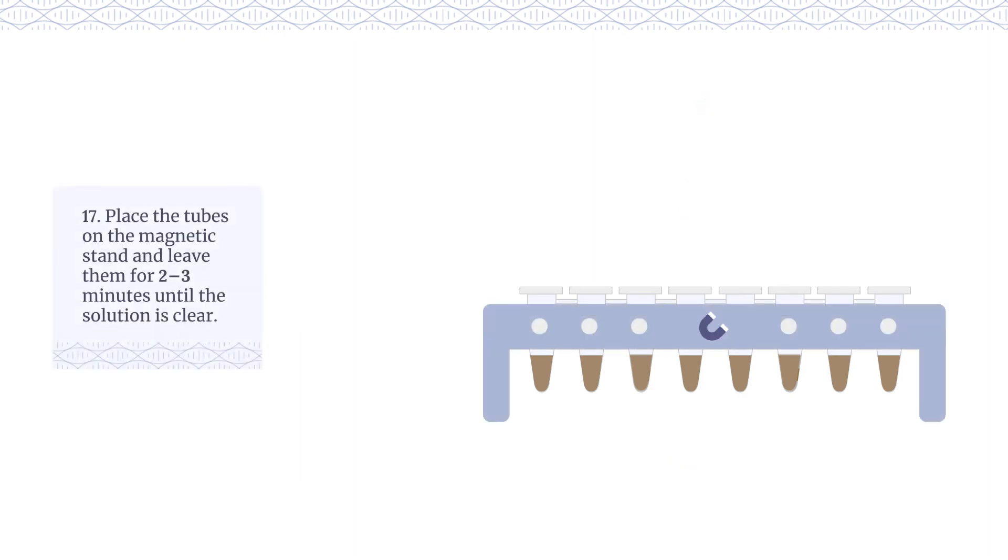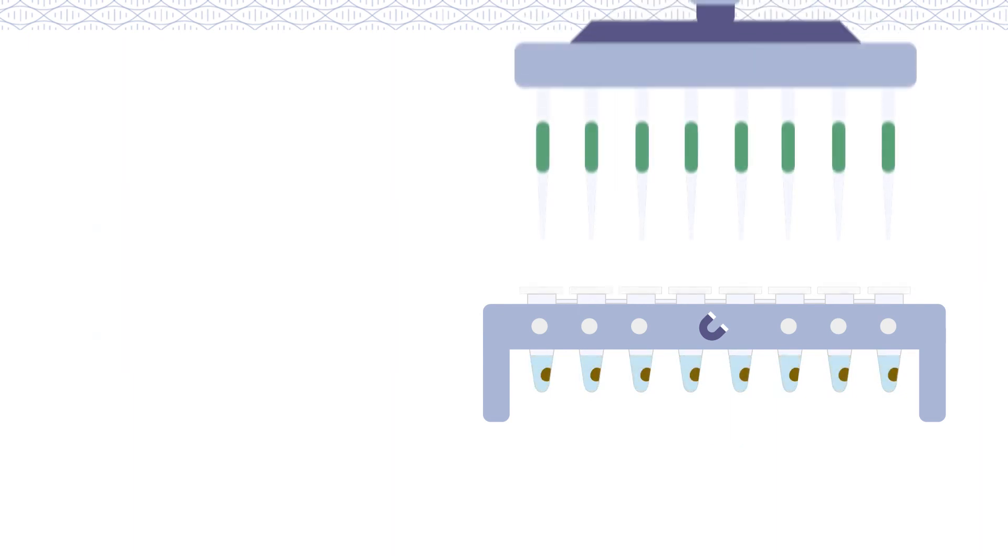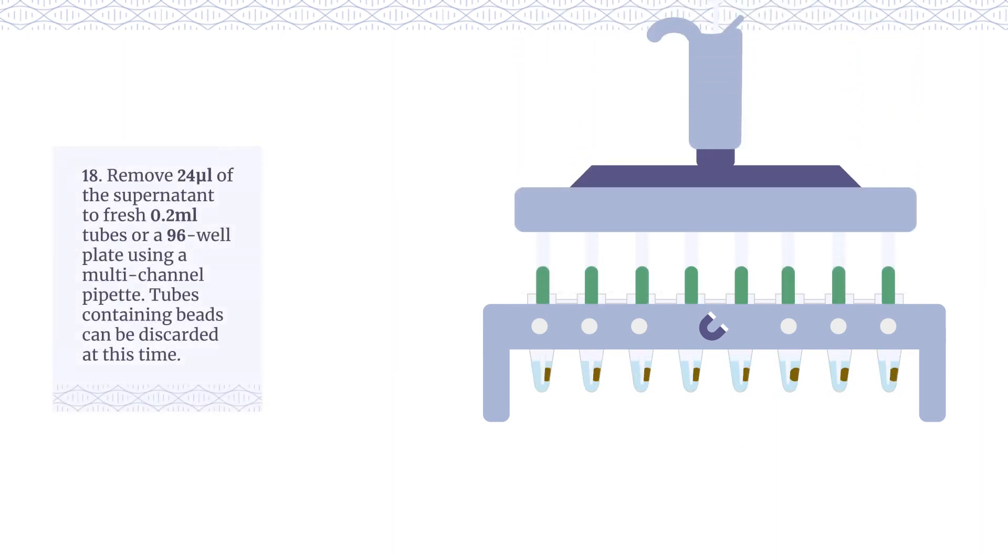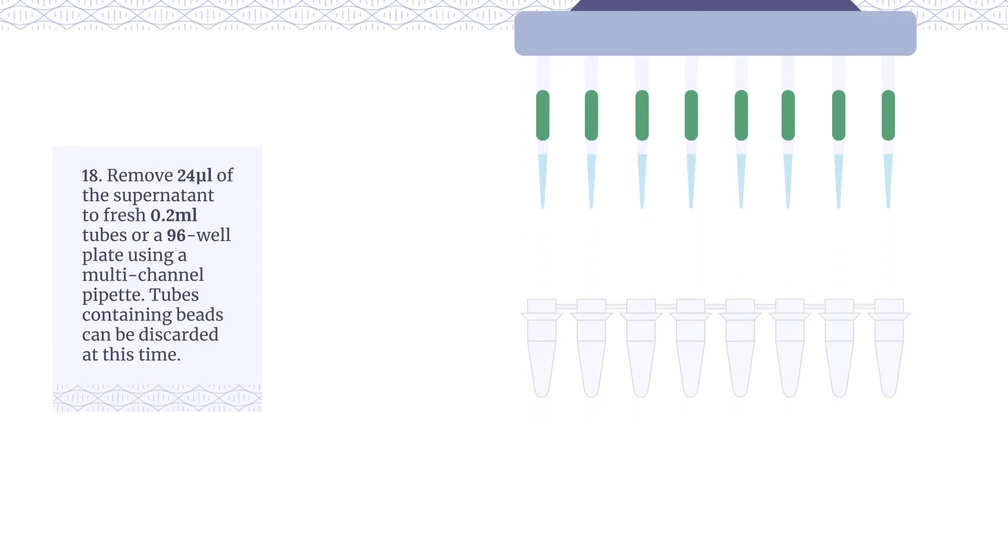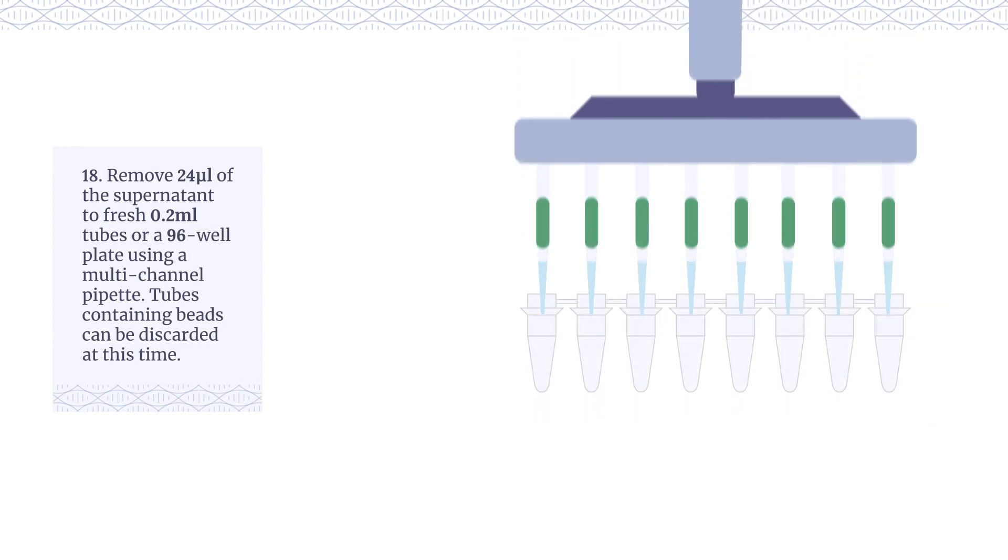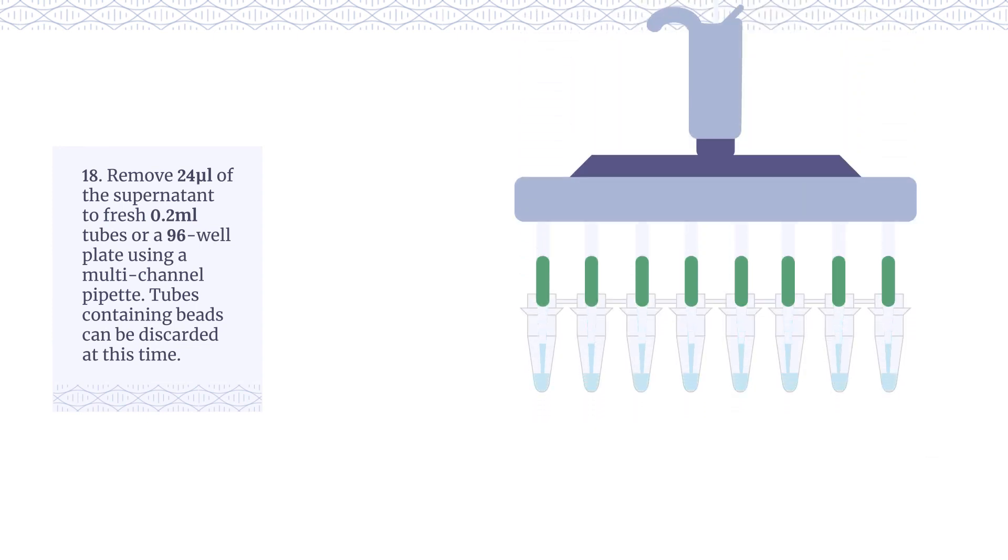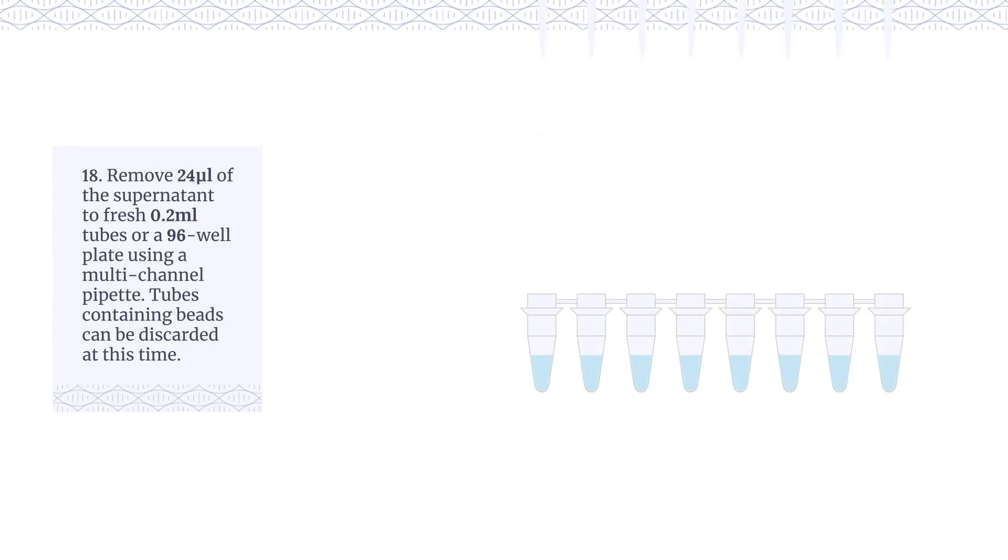Place the tubes on the magnetic stand and leave them for two to three minutes until the solution is clear. Remove 24 µL of the supernatant to fresh 0.2 milliliter tubes or a 96 well plate using a multi-channel pipette. Tubes containing beads can be discarded at this time.